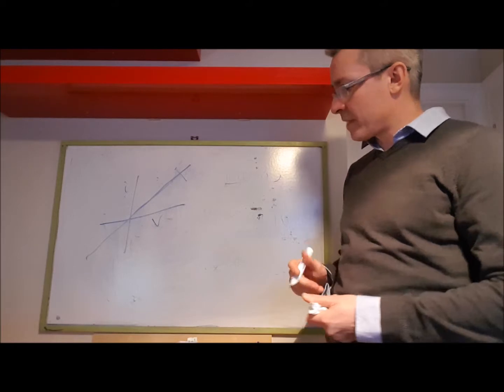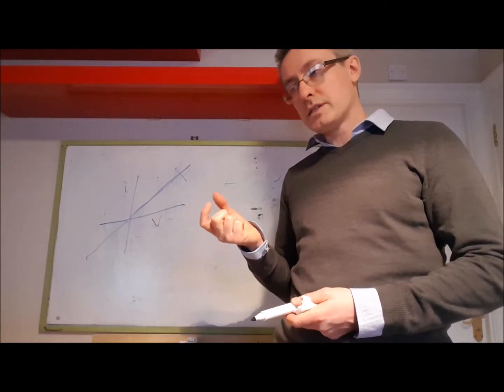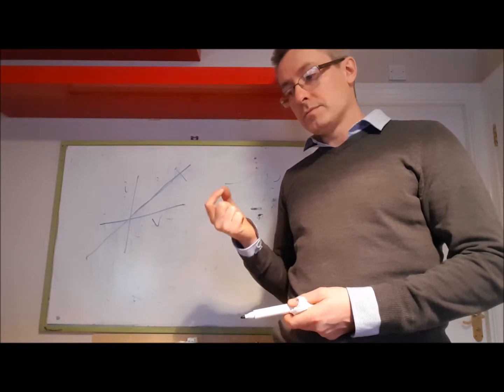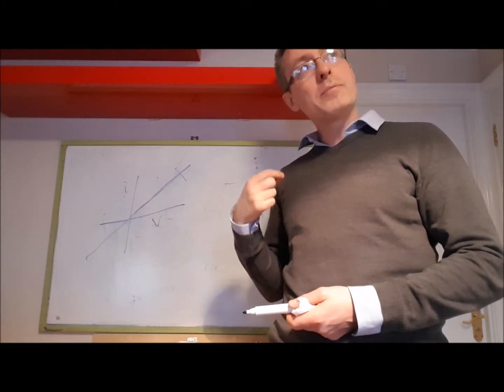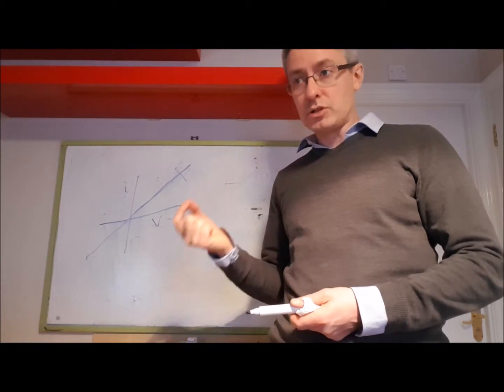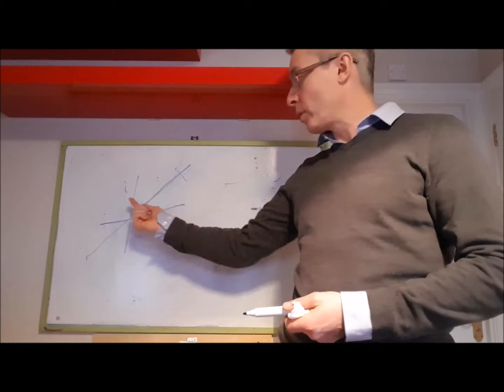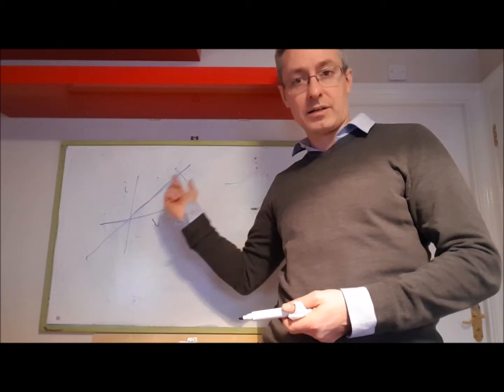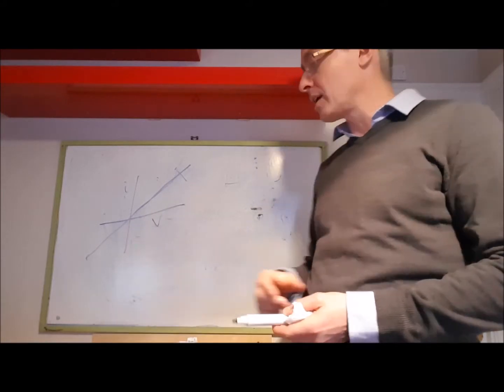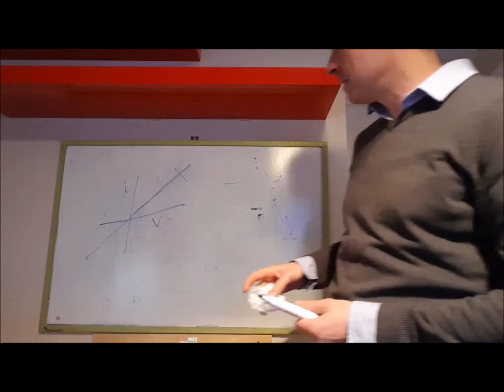Now, I'm sort of saying you could use these thick film electrodes to look at the conductivity of these oils, maybe look at the electrochemistry of those oils. But sometimes they might be very boring and there's actually nothing, you can't discern a molecule or clear features, you just get these straight lines. So that might be the result of that.